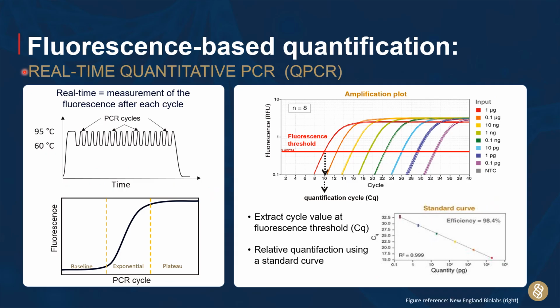When looking at the process of quantifying an unknown nucleic acid with real-time PCR, we follow the standard curve approach. Essentially, a standard curve is a known concentration of DNA that has the target gene of interest that is diluted down over a number of dilutions, typically between 5 to 6 dilution series of a 1 in 10 dilution. This generates something similar to what you see here, called a standard curve.